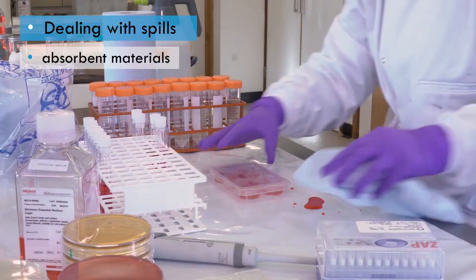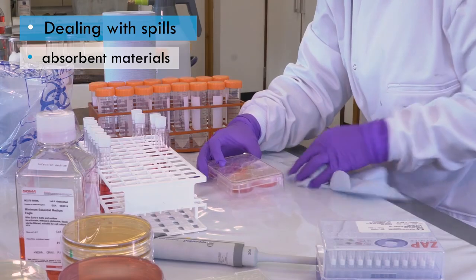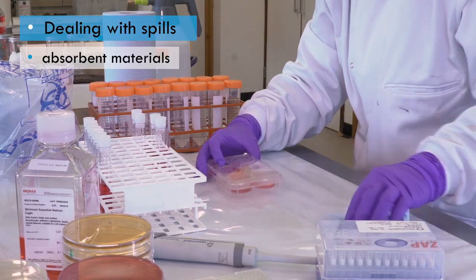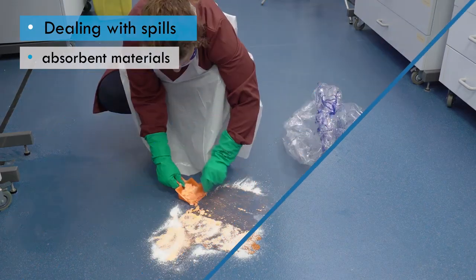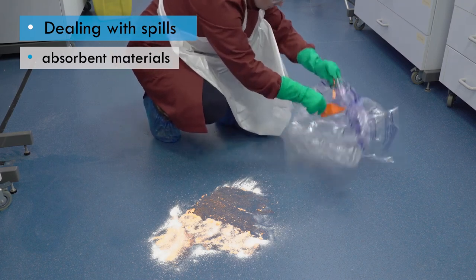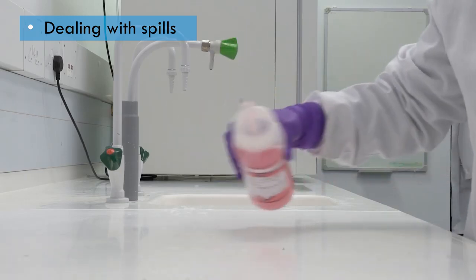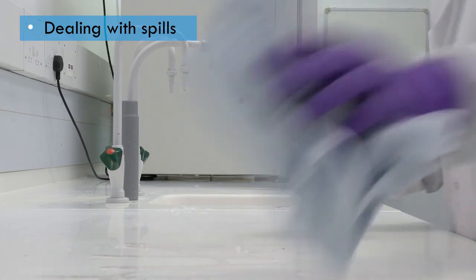The spill should always be mopped up and removed using absorbent materials such as disposable paper towels or gel preparations. These materials can then be decontaminated by autoclaving, incineration or disinfection before disposal. The spill area should then be decontaminated with an appropriate disinfectant, remembering the basic rules.